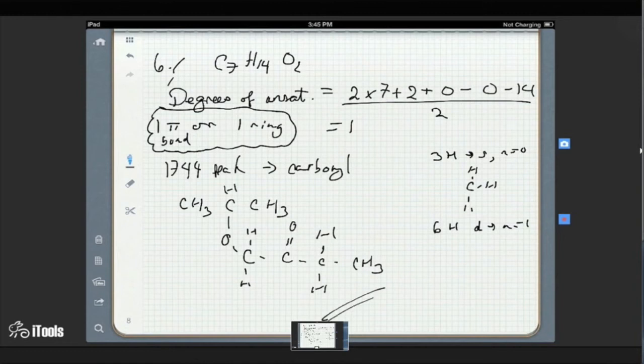Final answer, Steve. I await your judgment. Okay, so let me take a look at this. That one's tough. That was not fun at all. Okay, so let's look at the secondary carbon that's connected to the carbon on the far side. I'm looking at the carbon that's attached to the 2 methyl groups. Which peak do you think that is in your proton NMR?